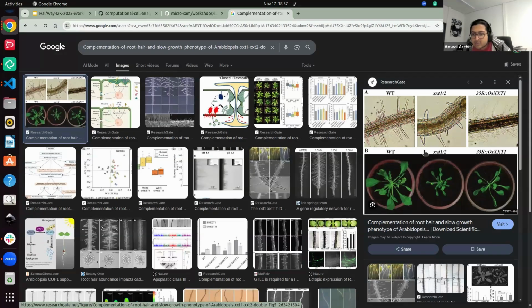How many annotated images do I need to retrain? For this one, another shameless plug: check the paper which I sent a few chats ago, which explores the same question. But a hand wavy answer for me is, if you have 10 densely annotated images, an important keyword, this should do a good job.